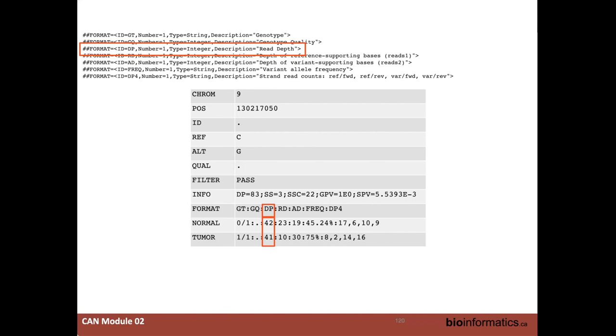Now, keep in mind, make sure that you do have a threshold cutoff. Whenever you go and do your sequencing, you need to tell them what your expectations are. My expectations a lot of the time are a 60 read depth. I'm only getting a 41 here. Is that sufficient for me? No. Am I willing to accept it? Maybe. Can they prepare another library and sequence it? Yeah, okay, let's see if we can get that. And hopefully they don't charge me, which is why you set those expectations up front.